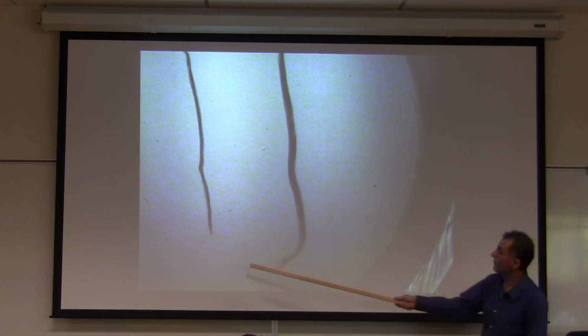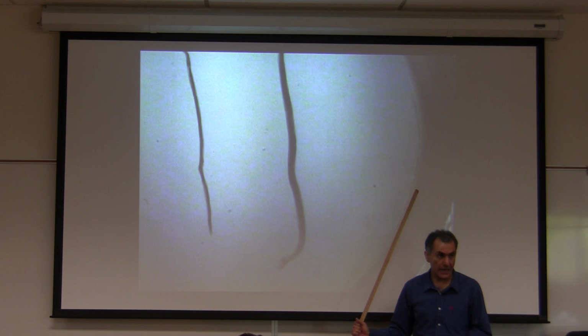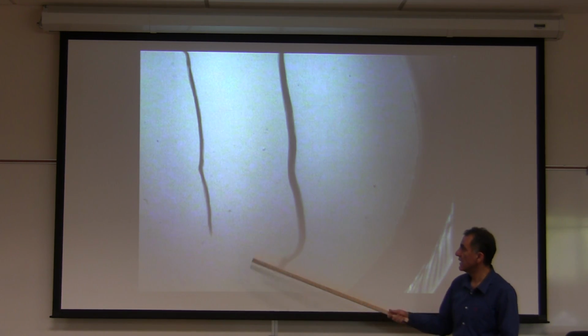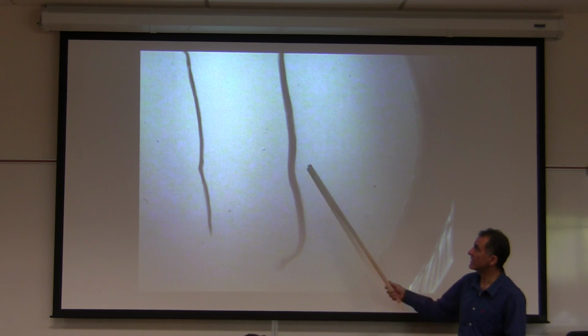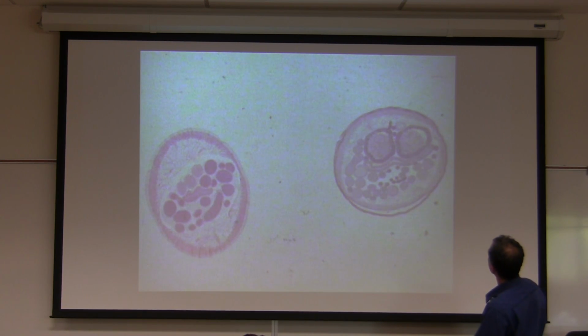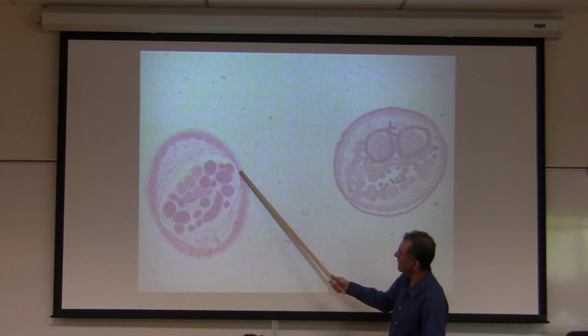Okay, what is the name of the organism? Ancylostoma caninum, Ancylostoma duodenale. Name of structure: copulatory bursa. It's a hookworm. Again, both of them, male, female. Do they have the nerve cord? No. What is the name of structure? I forgot to ask you that.